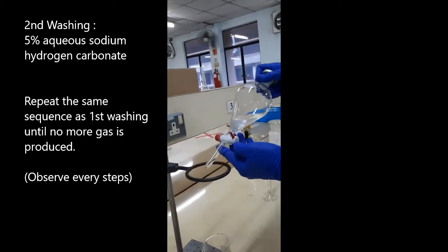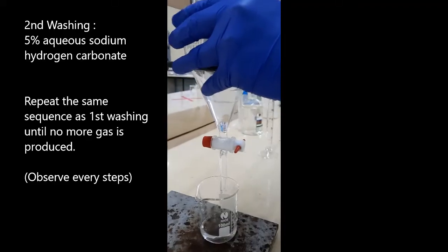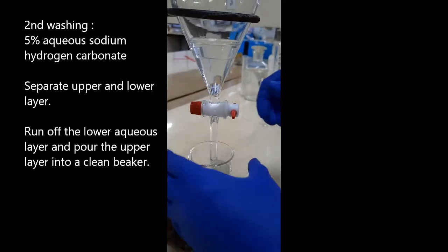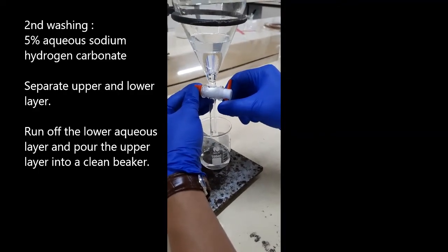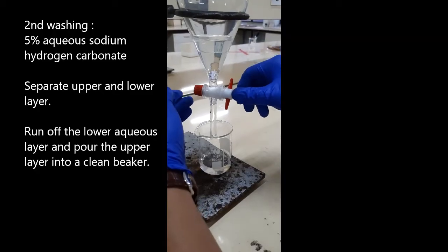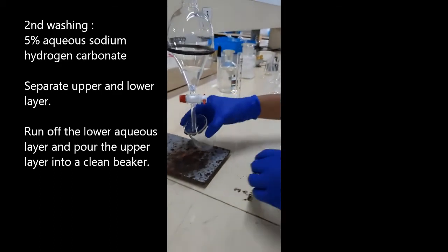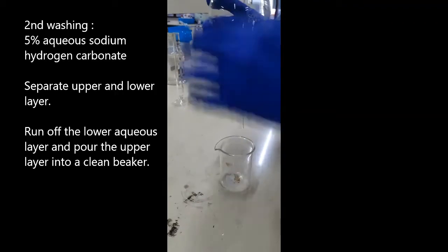Let the separating funnel stand for one minute and open the cap. Observe the two liquid layers form. Run off the lower aqueous layer. Collect the remaining layer in the separating funnel in a clean beaker or conical flask.